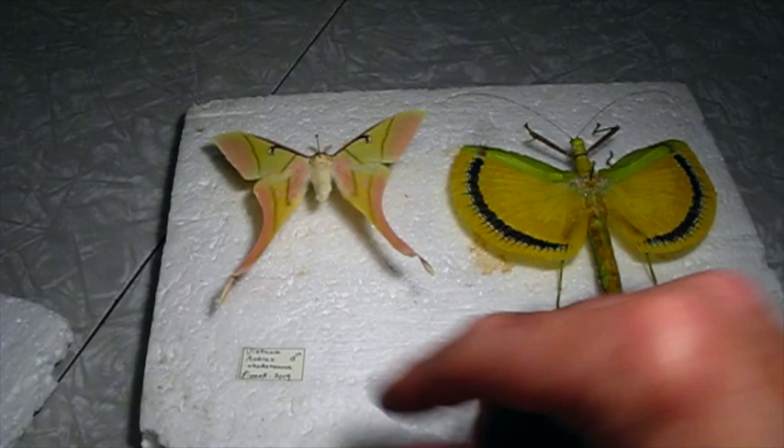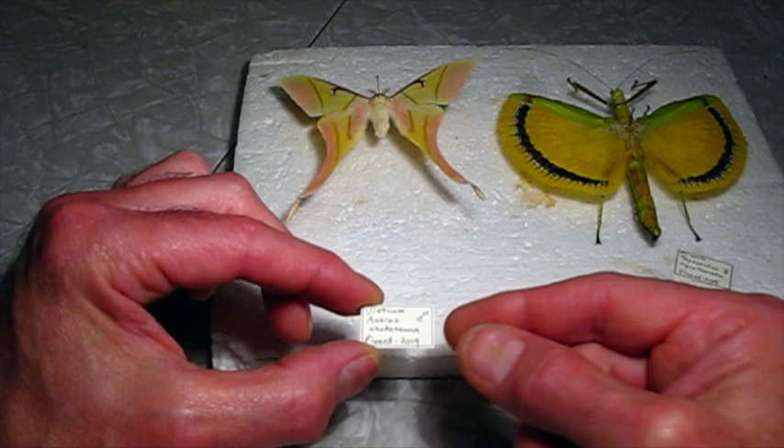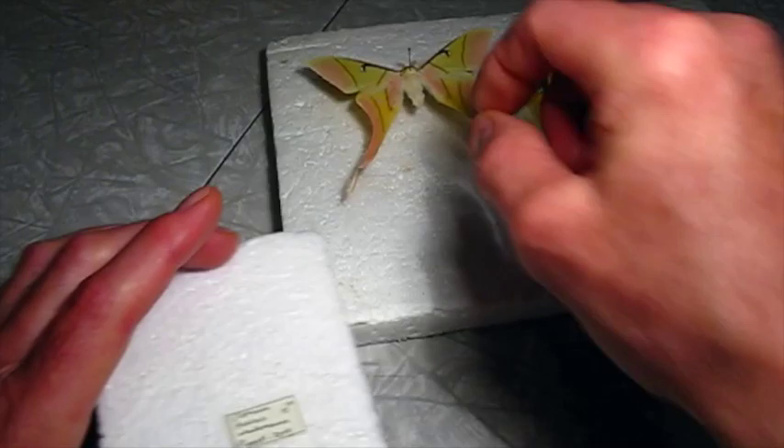We'll let that dry for a little bit. So let's get a data label on here. These specimens didn't come with much detail at all. I just know the country — Vietnam — and the name Actias rhodopneuma, and it's a male. The only thing I can put for a date is pinned 2019, because that's all I know about it.